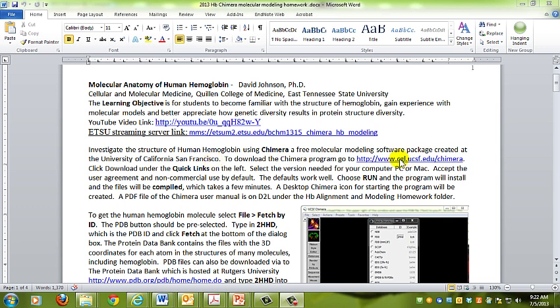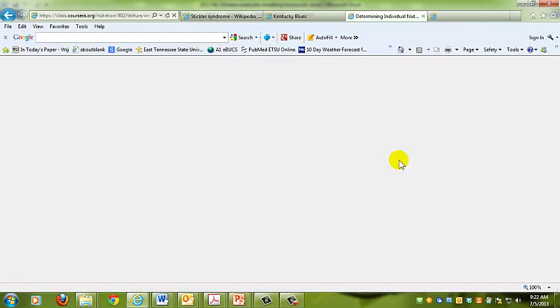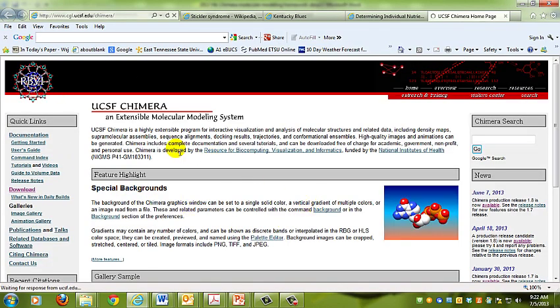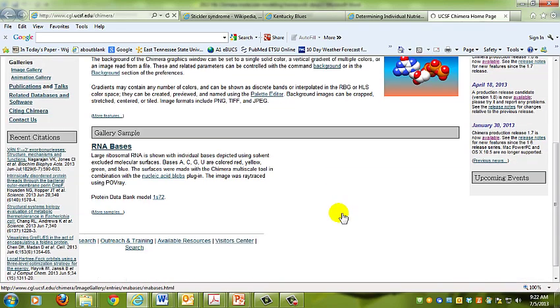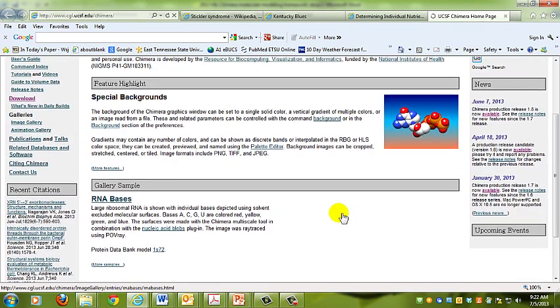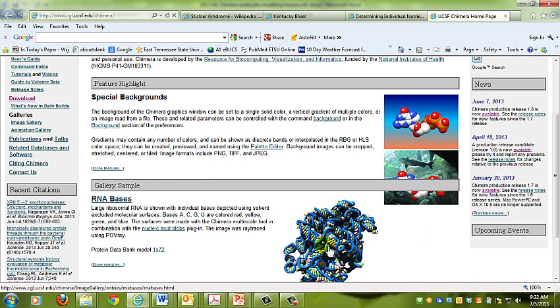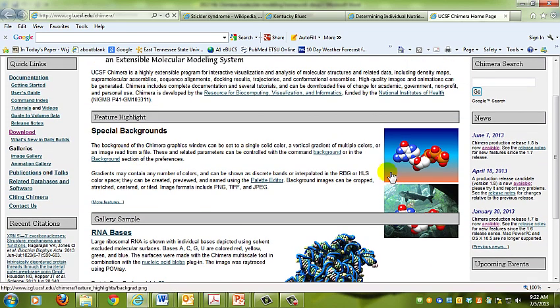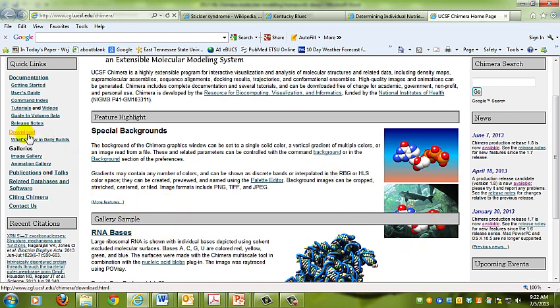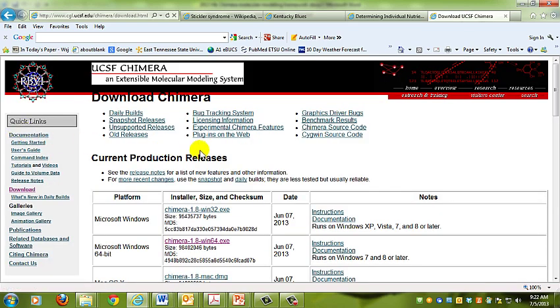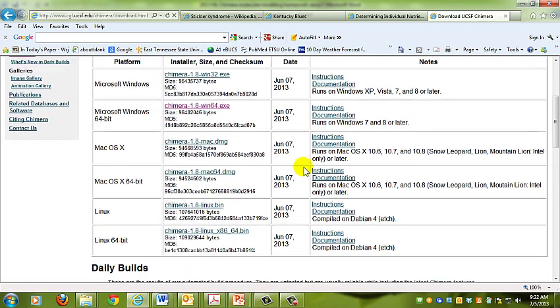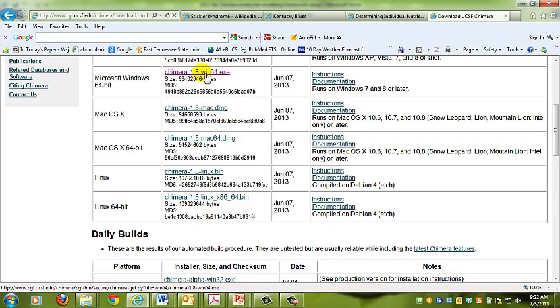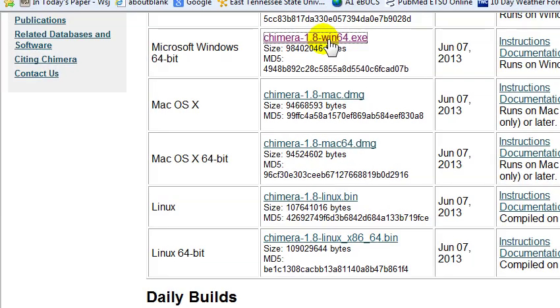We're going to control and click on this link, which will take us to the website for Chimera. You can see they talk about RNA and different things, they have gallery samples and pictures. We're going to go to the download page. You can see there are various versions of Chimera you can download. Since I have a 64-bit PC running Windows 7, I'll pick this one here.